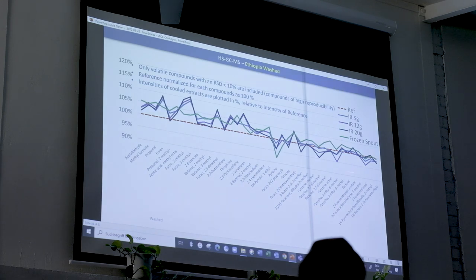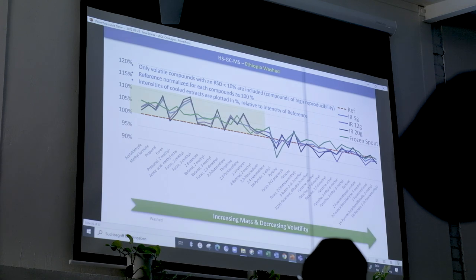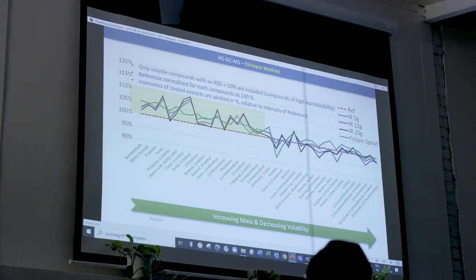And what you see is that the compounds that are the most volatile seem to be increased selectively. Compounds that come later, that are less volatile, are less affected by extract chilling. They are more or less at the same level as the reference that is not cooled. So this is a second, very different technique of measuring the volatiles, and we see the same phenomenon. It's a little bit less sensitive, but it's good to check it with different techniques. And this is for the Ethiopian washed.